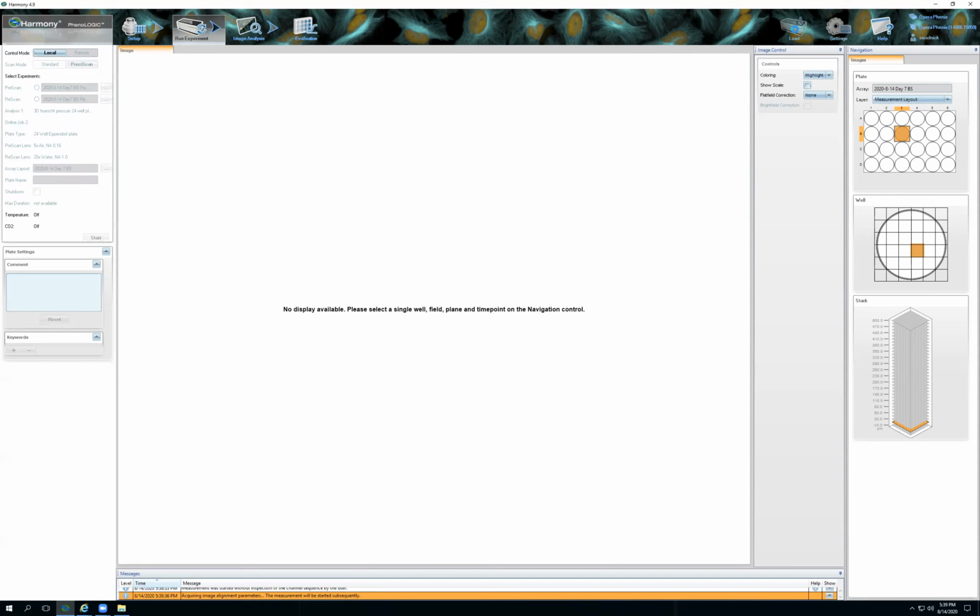So now if I were to have focus issues with the 5x air, I would assume that it's got water on it from the bottom of my plate. So I'm just going to do this again. I'm going to call this test, and I'm going to hit start.